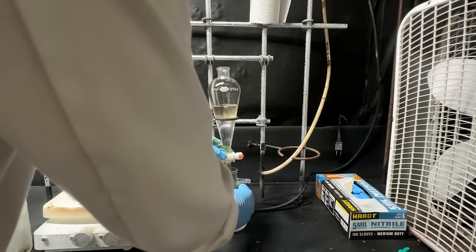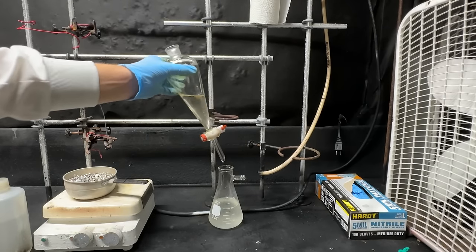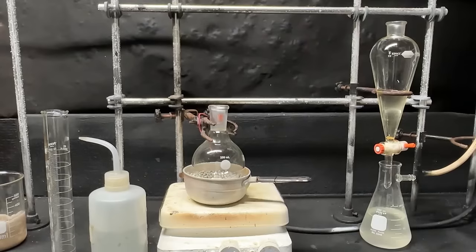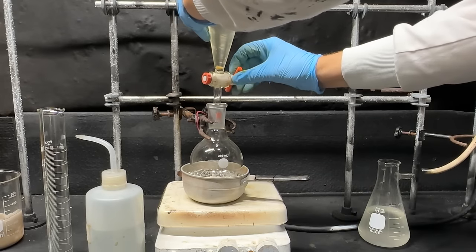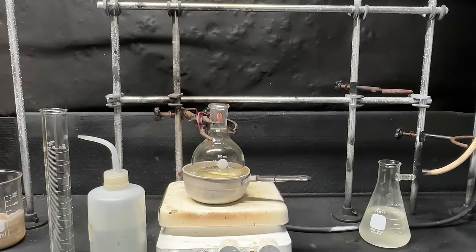Let's dump off our water layer and we're almost done with our workup. There is our crude banana oil. Using the same flask as before we'll dump all of our banana oil into it. Now I'm going to set up for a simple distillation.